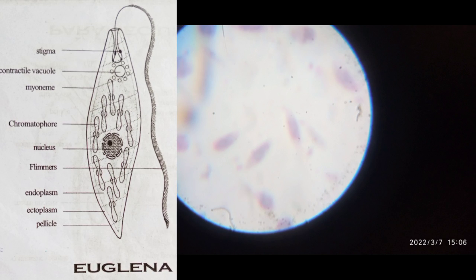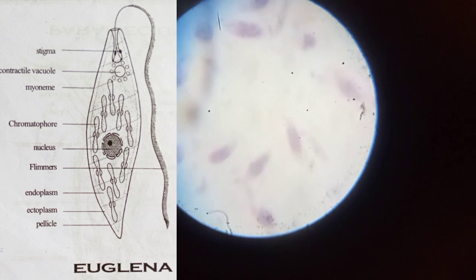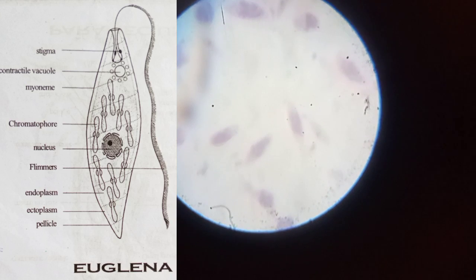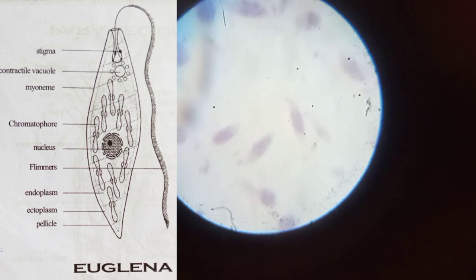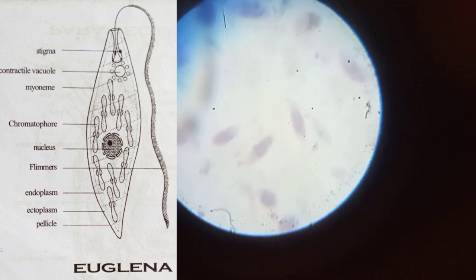The anterior part is blunt. It has a cytostome, cytopharynx, and reservoir at the anterior part. It also has whip-like flagella and a stigma.